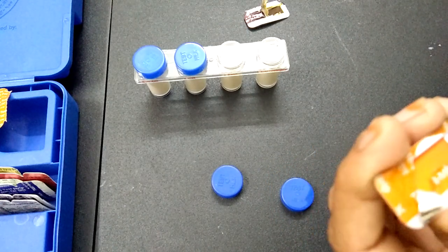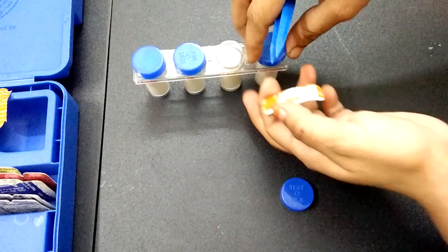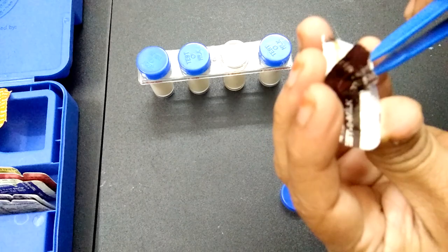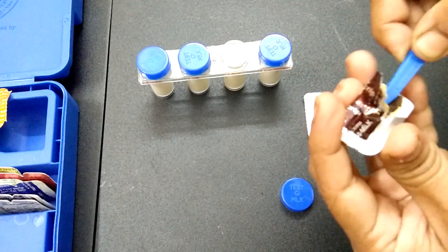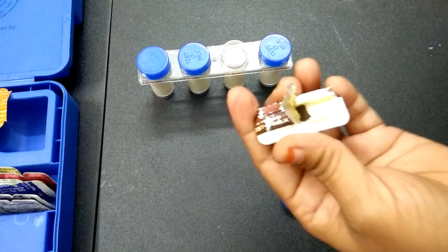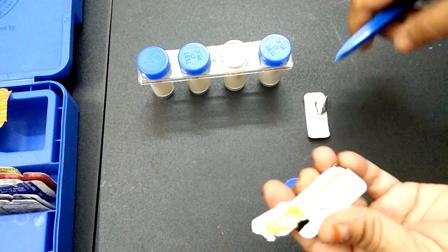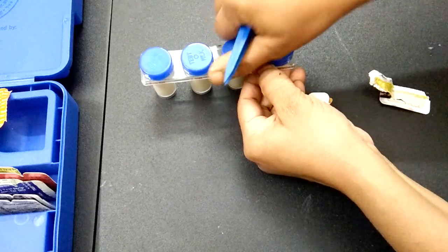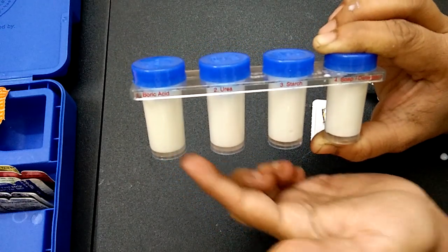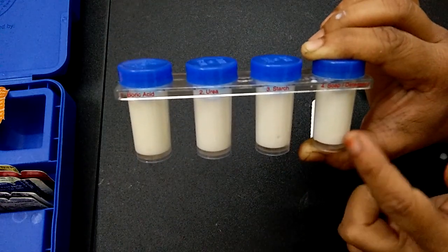I am putting the detergent strip into the detergent tube and closing the lid. Similarly, let's put the starch strip into another tube — dip the starch strip into the milk tube and close the lid. Now we have placed the boric acid strip in the boric acid tube, the starch strip in the starch tube, and the detergent strip in the detergent tube.